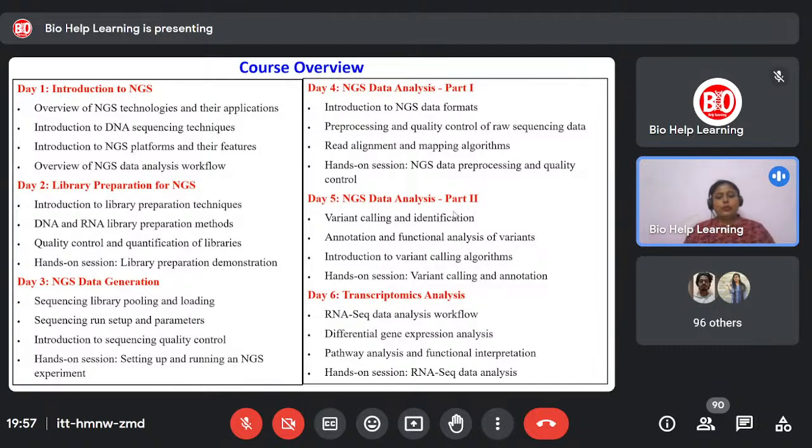Sixth one is the transcriptome analysis, where you can retrieve the RNA sequence data, perform differential gene expression analysis, pathway analysis, and functional interpretation.